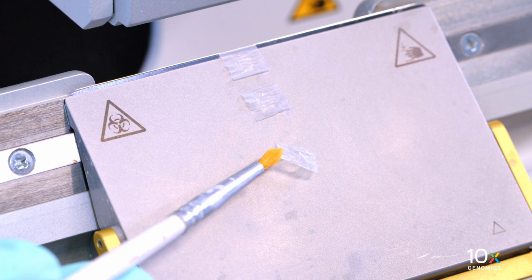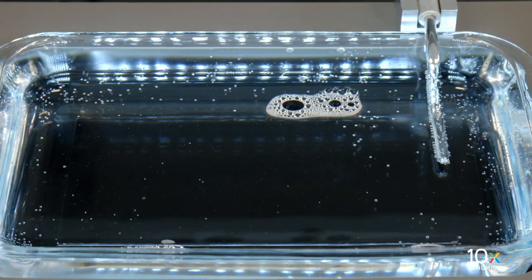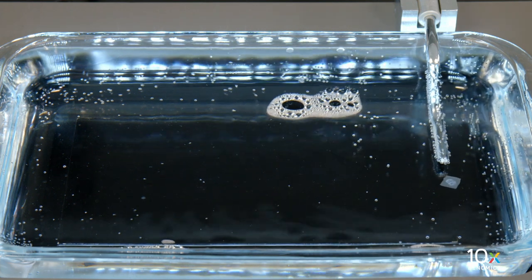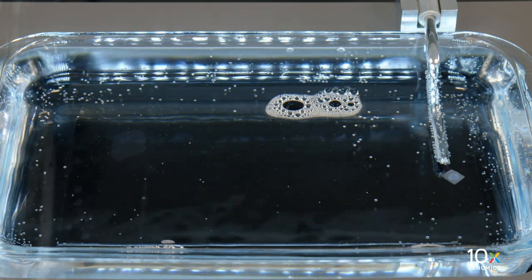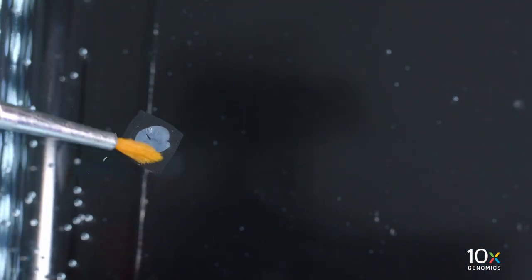With chilled sectioning probes, pick the section up from underneath and immediately place it on the water surface of the water bath, making sure that the probe goes underneath and away from the section. Let the section float on the water bath surface until most of it is flat and without wrinkles. The floating time depends on the sample type.